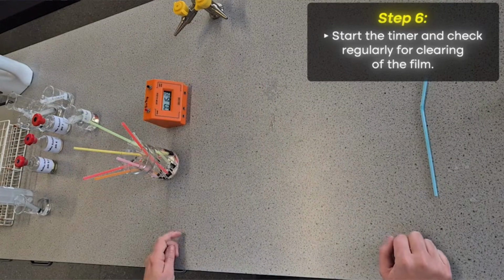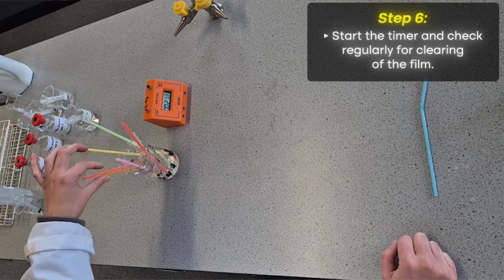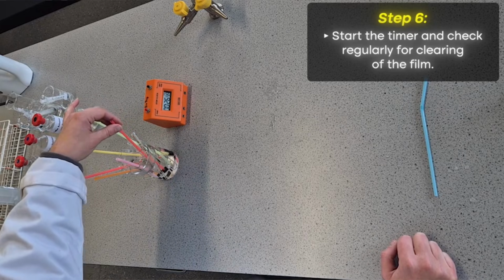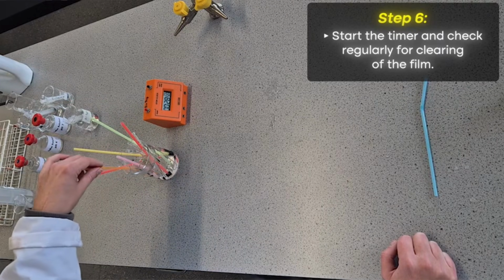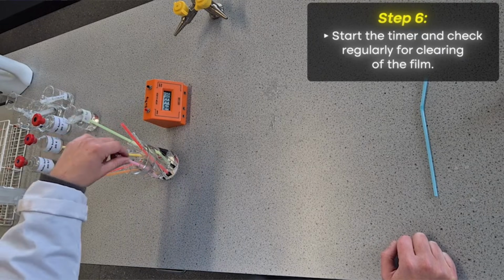And now they need to consistently, to standardize the method again, move the sticks so they all get the same level of mixing and checking. So I'd recommend that they just go round in a circle like this, and then that's approximately 5 to 10 seconds.